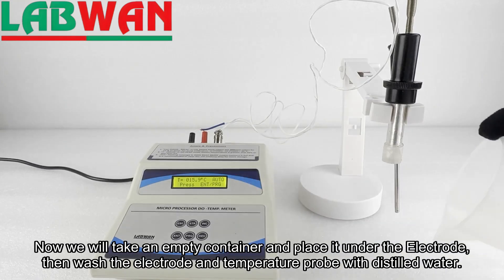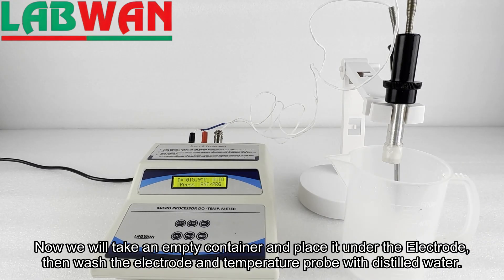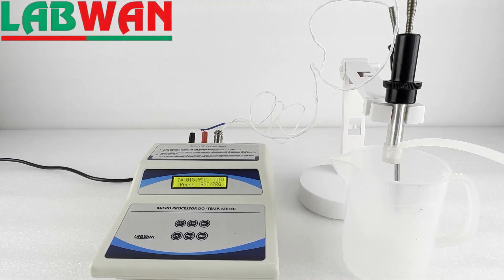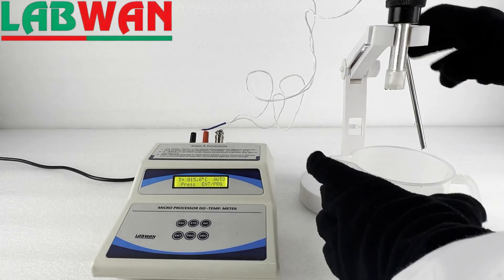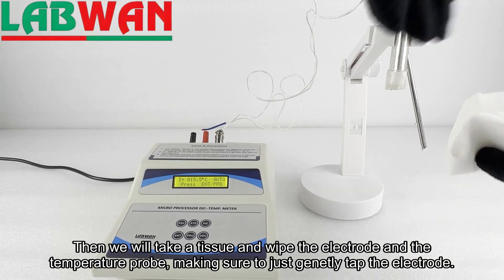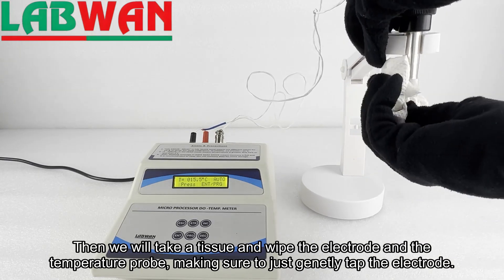Now we will take an empty container and place it under the electrode, then wash the electrode and temperature probe with distilled water. Then we will take a tissue and wipe the electrode and the temperature probe, making sure to just gently tap the electrode.